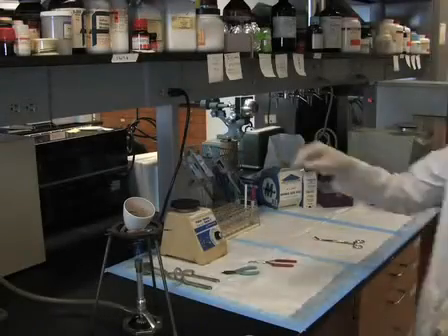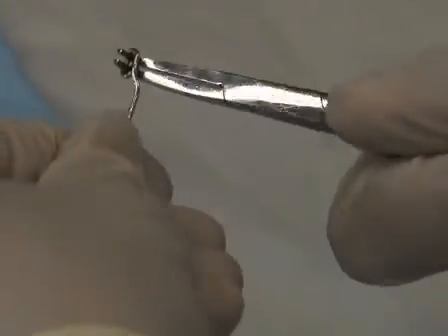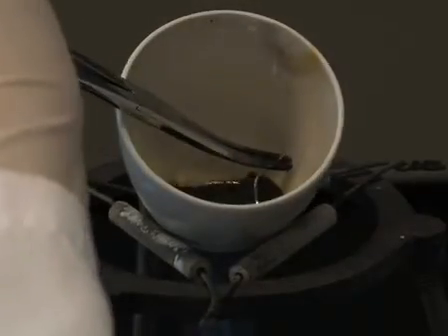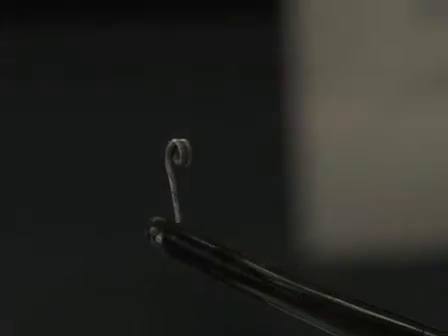Now we will show you how to prepare the silver electrode. Take a 5 cm piece of silver wire about 1 mm in diameter. Roll it 3 to 4 times into a coil with an inner diameter of 2 to 3 mm. Keep the rest as a tail which will bend such that it is at a right angle to the helix. Coat the tail and the adjacent 5 to 10 mm of the silver wire with molten silver chloride.